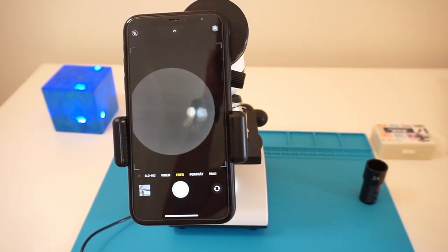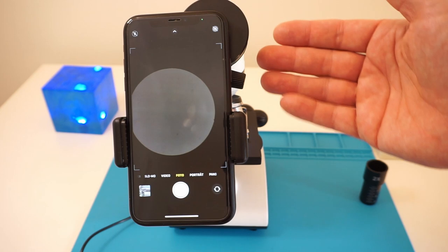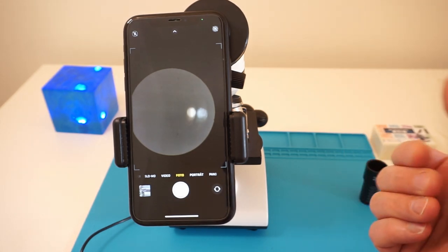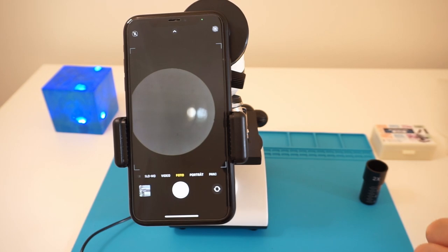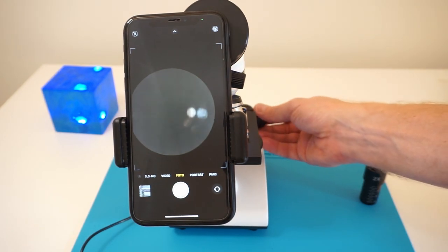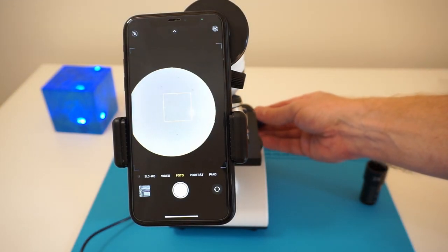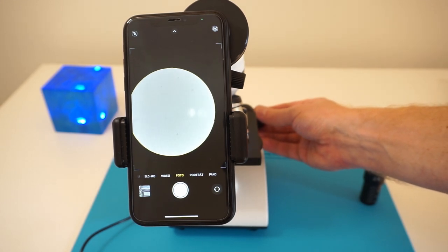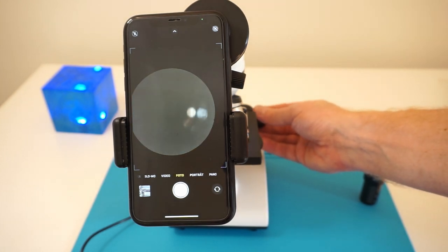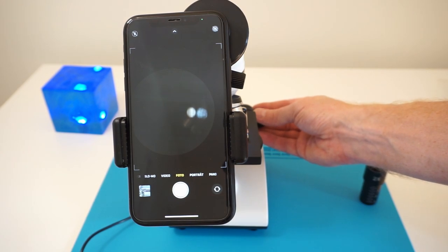Now the question is, what is the highest magnification I can really use in this setup? What I did, I kept the 25 eyepiece, and now I'm switching to the 40 magnification objective, which would result in 1000 magnification. If I'm trying to find the focus, you will see it doesn't work. It's getting dark. If I go away from the CPU, there's some light. And if I go closer and closer, there is nothing coming into focus, and it's getting dark. That's clear because the objective is now very close to the die, and it somehow prevents the built-in light source from reaching the objective.